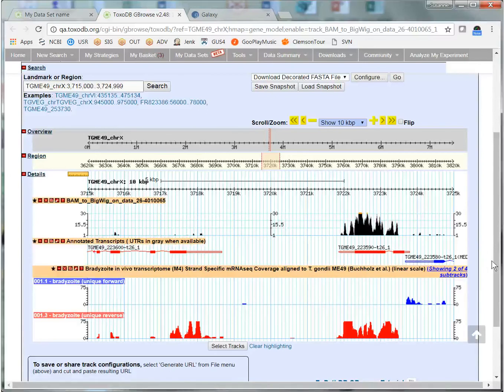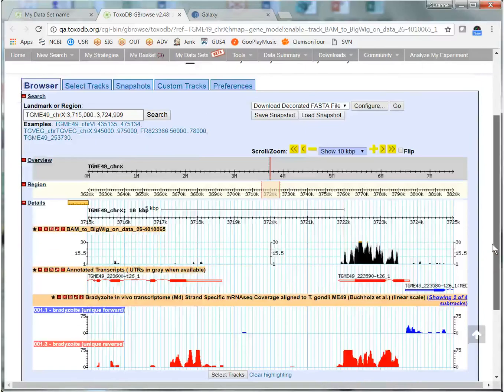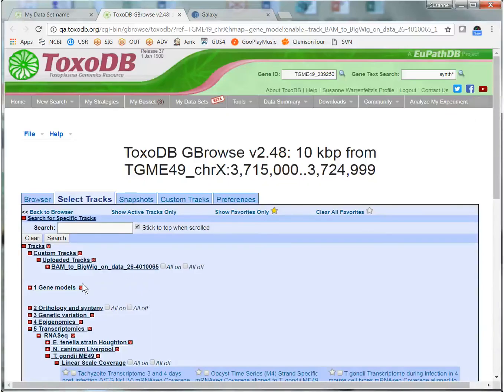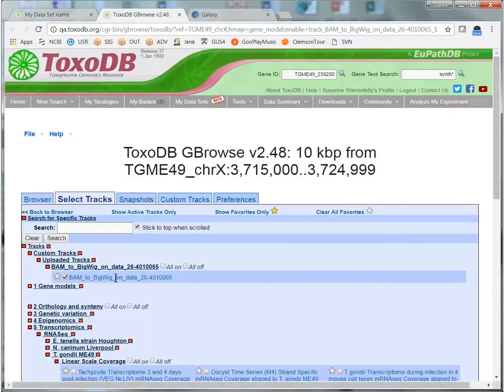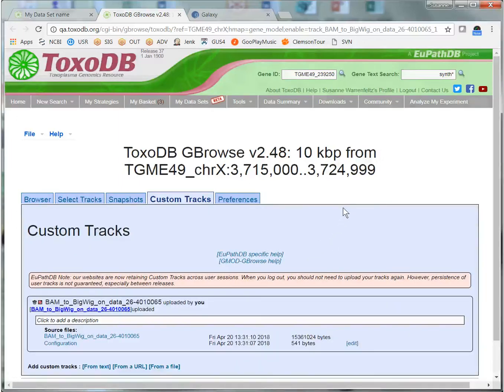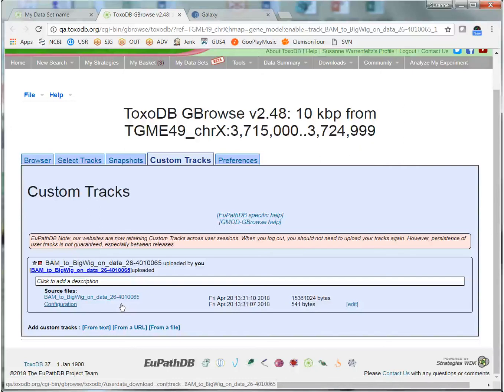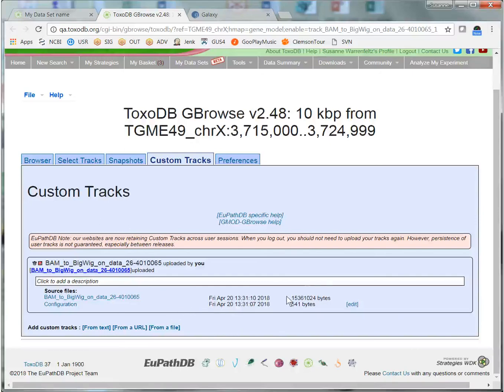I can also manage my track within GBrowse. The tracks appear in the Select Track page, so I can turn them on and off. And in the Custom Tracks page, I can delete them from GBrowse. They'll still remain in My Datasets in the ToxoDB My Datasets page, but they will not be installed in GBrowse.